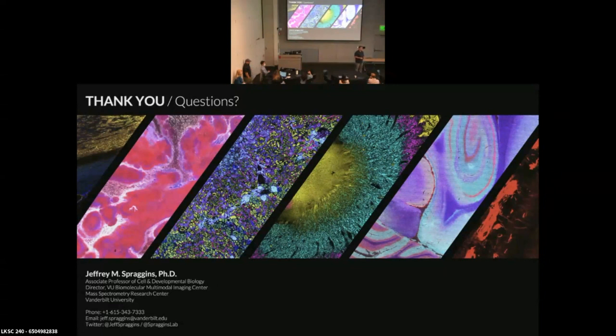Hi, that's a really cool talk. So coming from an immunofluorescence background, I know you mentioned there's maybe this 60 kilodalton boundary of identifying proteins. So I'm kind of curious, in the single pixel where you get this spectrum, how convolved is that? How many proteins do you think go into that, and how many can you reasonably identify? Do you use nearby pixels to improve your fit and identification?